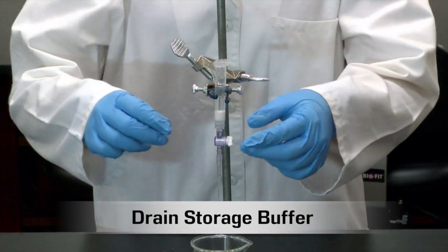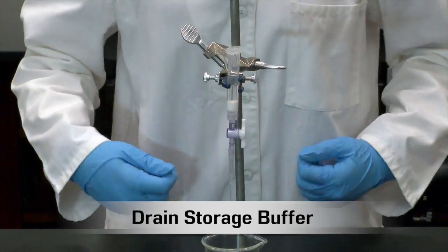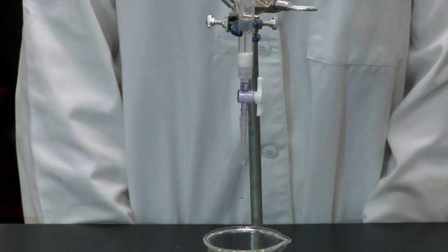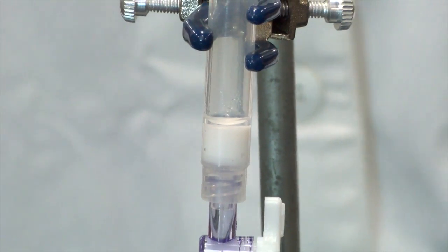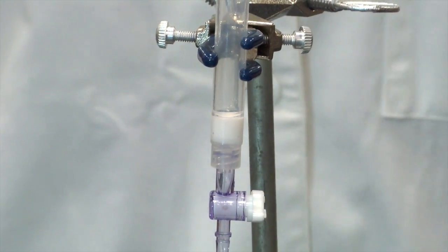One partner should set up and prepare the column on a stand. Turn the stopcock valve into the vertical direction so that the storage buffer can flow into the waste beaker. When the liquid is just above the resin bed, turn the stopcock to the horizontal direction to stop the liquid flow.